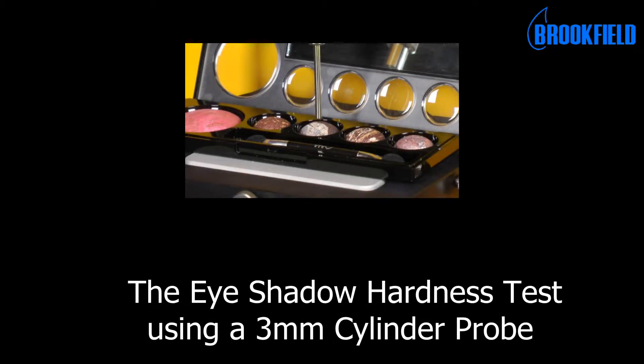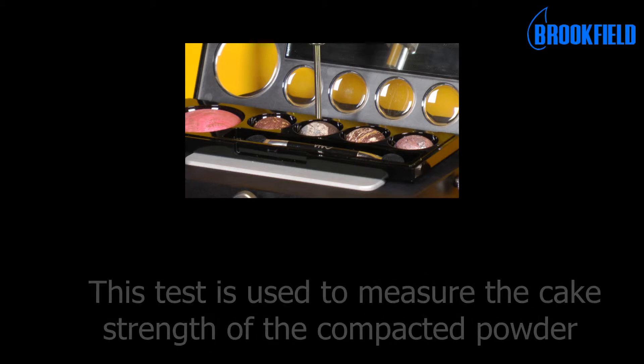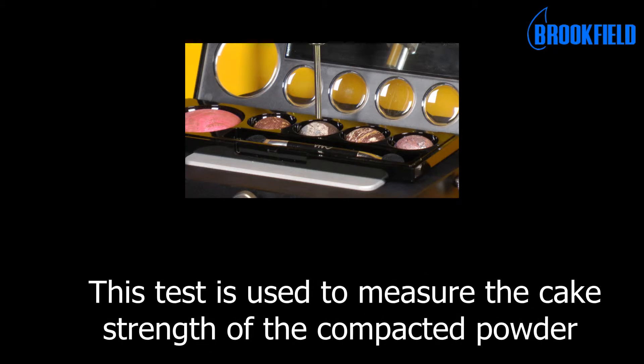This is the eye shadow hardness test using a 3 mm cylinder probe. This test is used to measure the cake strength of the compacted powder.